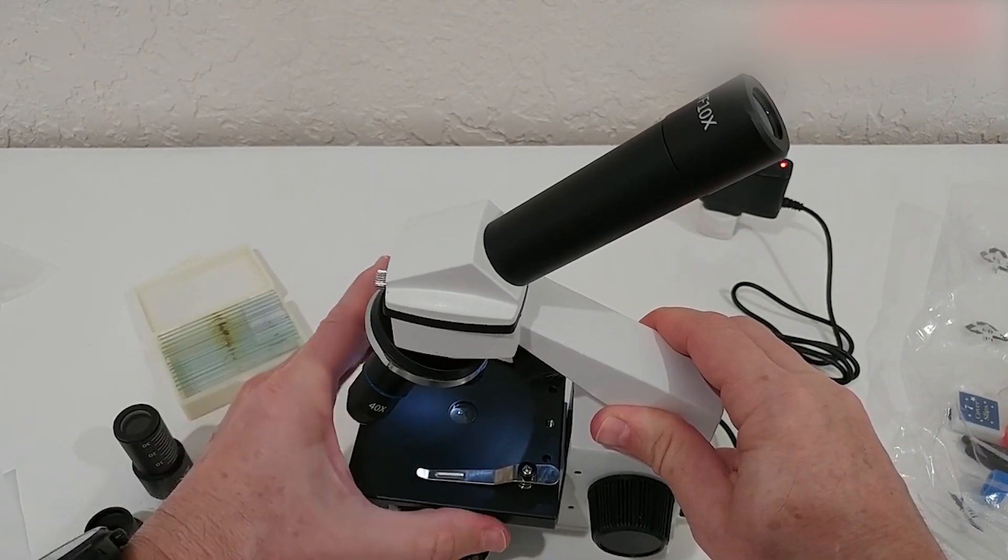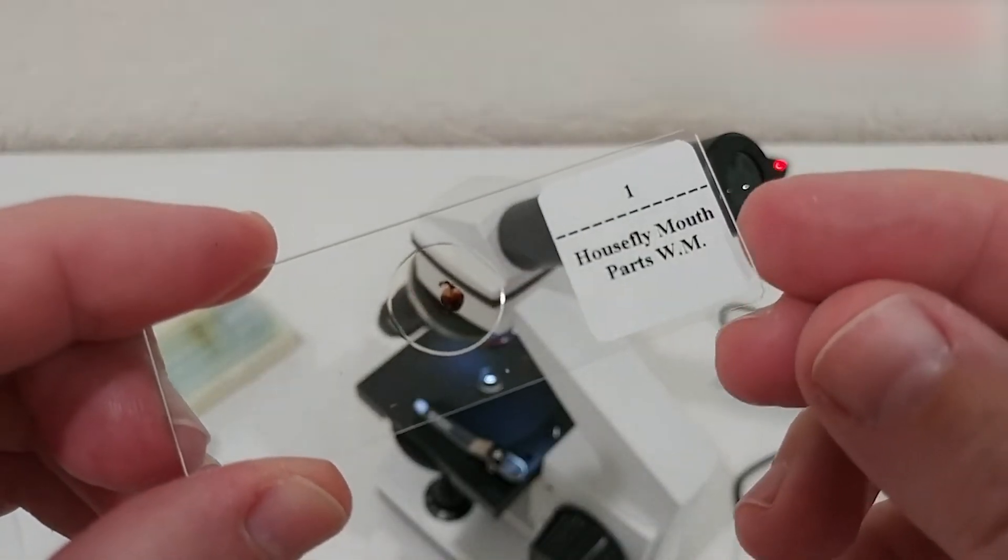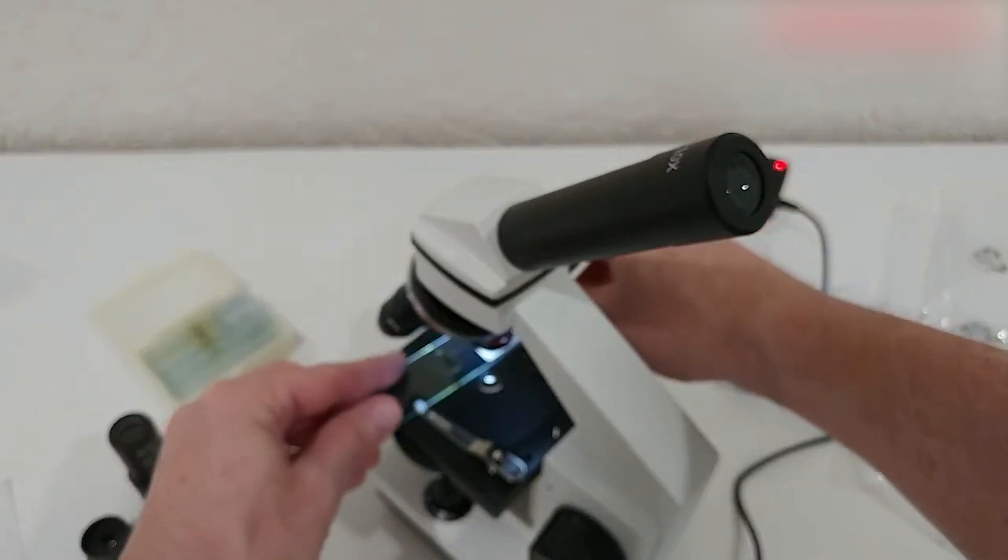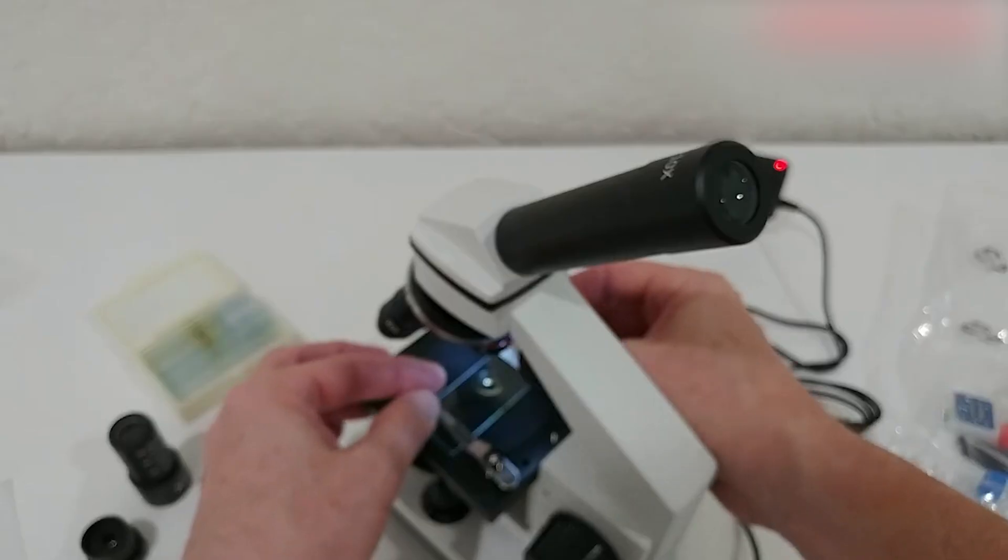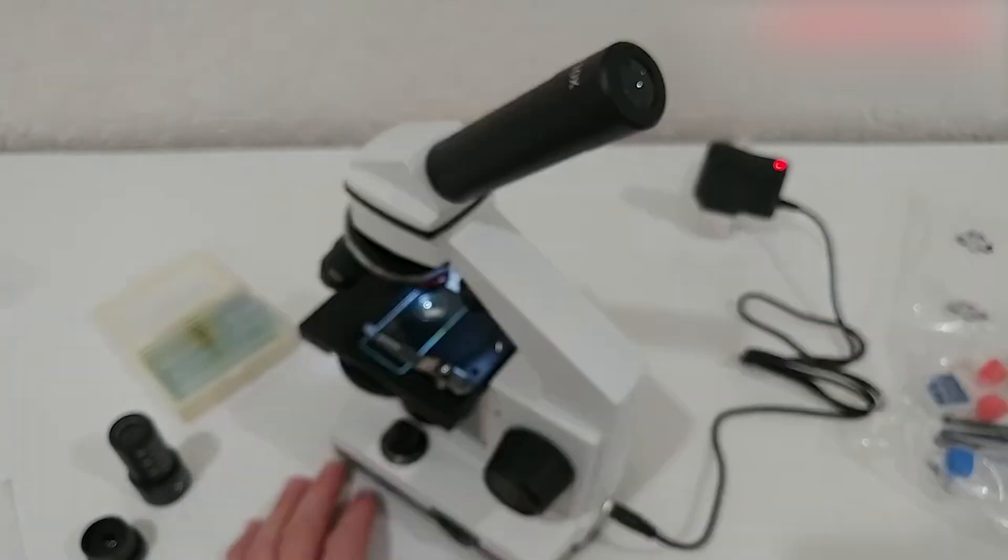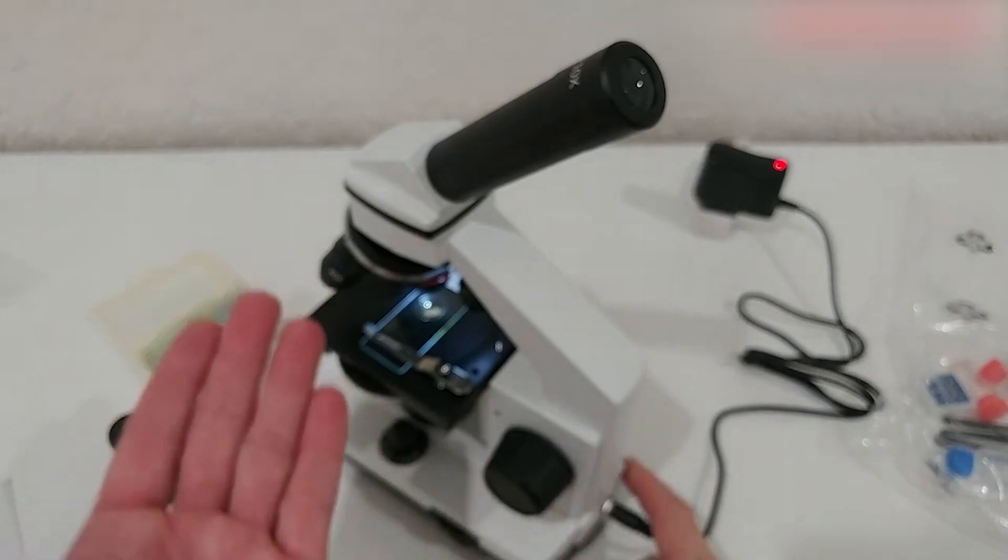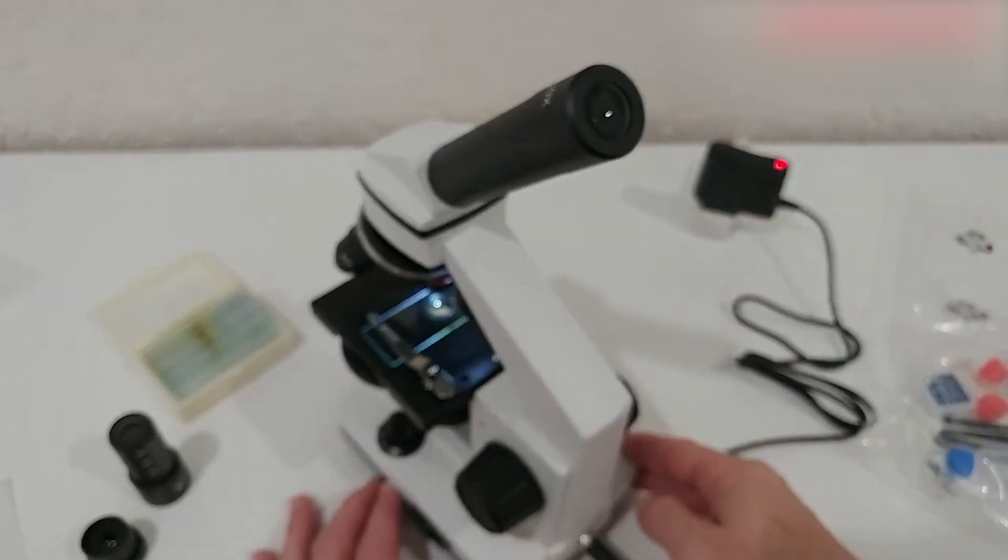With this microscope, you can help curious minds discover the fascinating world of life at a microscopic level. From examining the structure of cells to observing the details of small organisms, this powerful microscope opens up a world of possibilities for learning and discovery. Get ready to embark on an exciting journey into the unseen wonders of nature.